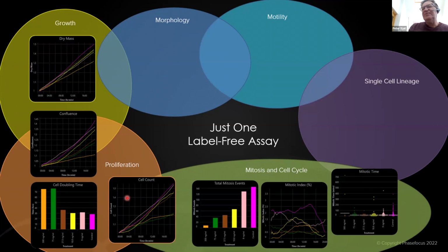One of the really interesting things about quantitative phase imaging is that the density of the image, rather than being of a fluorescence label, directly equates to the dry mass of the cell. So we're measuring true cell dry mass. This gives us an extra parameter when tracking cell movement as well, because we know that mass won't change from frame to frame too much until the cells divide. So as well as measuring cell mass, it gives us this extra little handle on tracking.